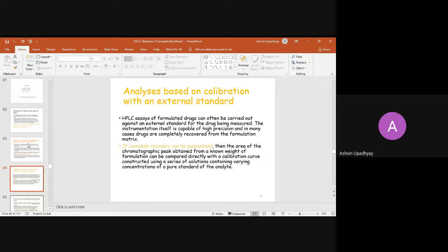Okay. So this is the final assaying result value in your sample analyte, then it provides you the compliance of your analysis. Otherwise, you are facing many problems related to the interference of other drugs.